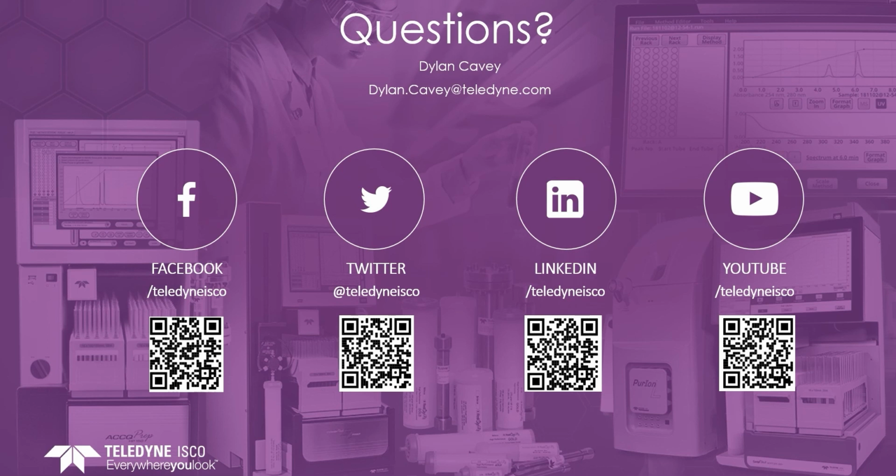Another question is, why might I want to use a different column for that focus gradient? As I mentioned in the webinar, you can change the size of your column before you move on to that focus gradient. A lot of the time we're going to see the scout run performed on a smaller column with a limited amount of sample, because our samples are important to us. Those are precious samples. So we can scale up in the focus gradient. We can go from a 5-gram column to a 120-gram column, and then we're able to load more into that focus gradient, and that's able to separate more of our compound of interest. Again, that's just going to save you time and save you money, and that's what success in flash is all about. It's about good separations and saving us the most time and money possible.